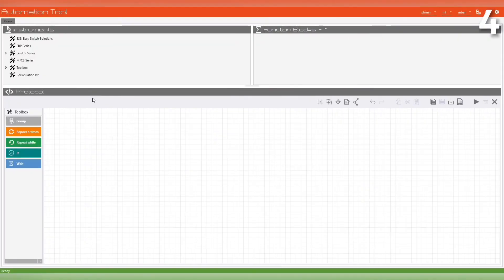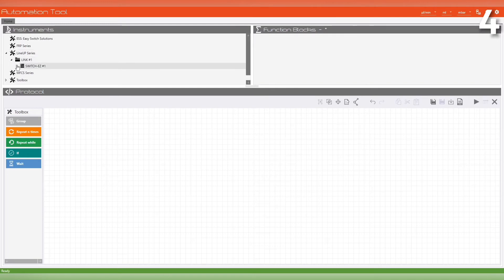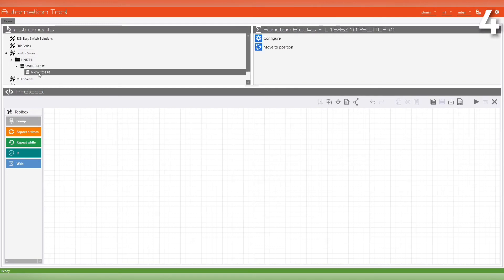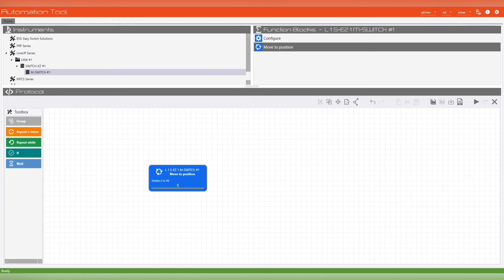To control the valves through the software, open your MAT. Click on the valve icon. In this menu, select the type of valve and set the desired position. And that's pretty much it.